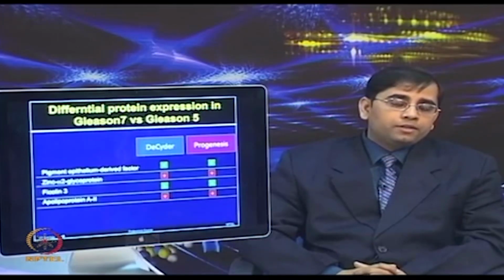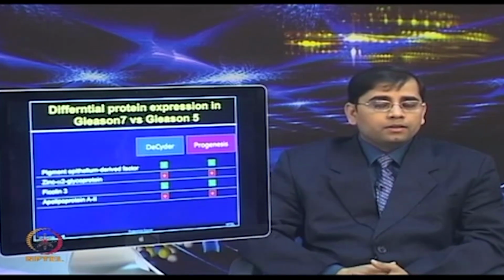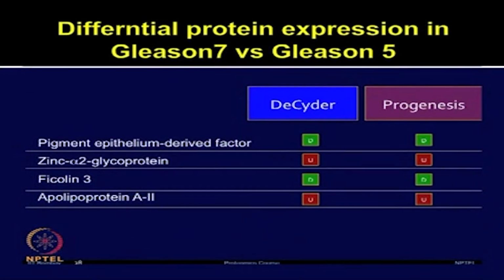After mass spectrometry, the identity of these proteins was established. The authors also analyzed these DIGE gels using two different software packages, DeCyder and Progenesis, so that they would be confident that all the proteins analyzed by mass spec were very reproducible.